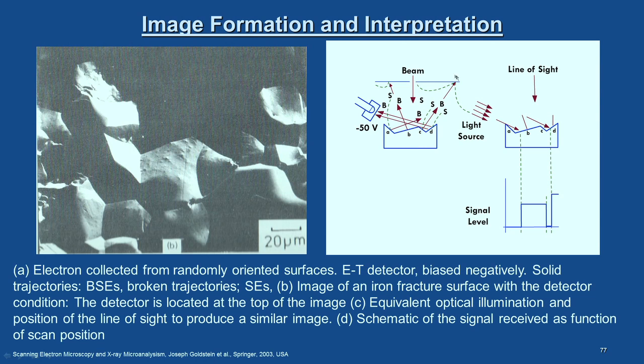Right now, we will just stick to this schematic, and then we will look at this second portion after we finish the discussion here. So, what you see here is the signals which are directly getting into the ET detector will appear bright. So, similar situation is shown here.